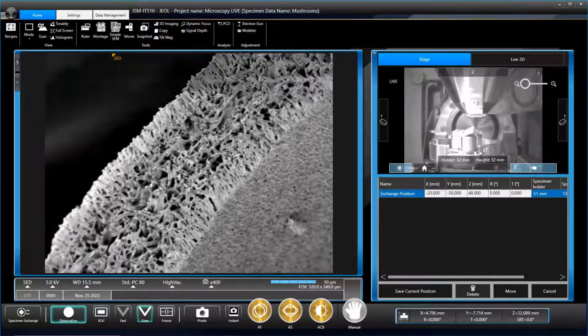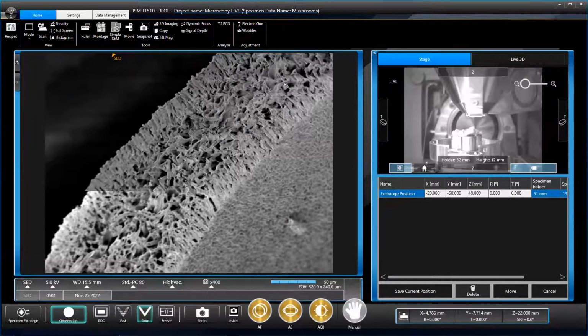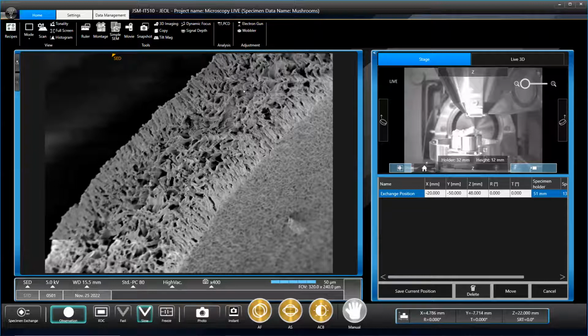Those mushrooms are another one that's a bit challenging. They grow on dying deciduous trees. They're around all year round. I think you can find them in this country a fair bit. Very challenging. Like this is right on the edge. Yeah. And again, I did drop these, just to see if they'd all move around.